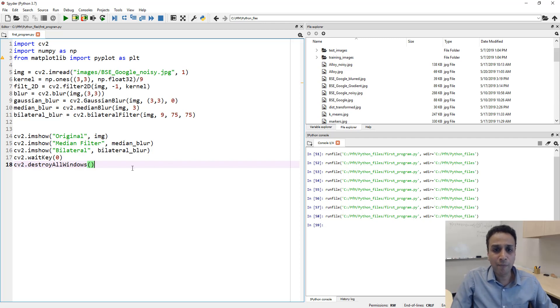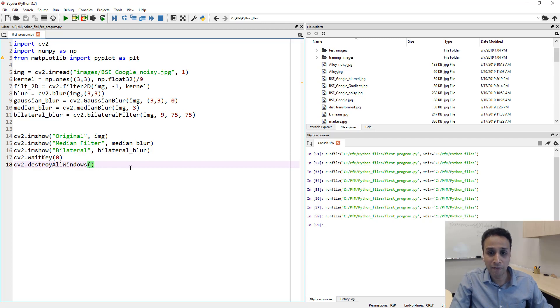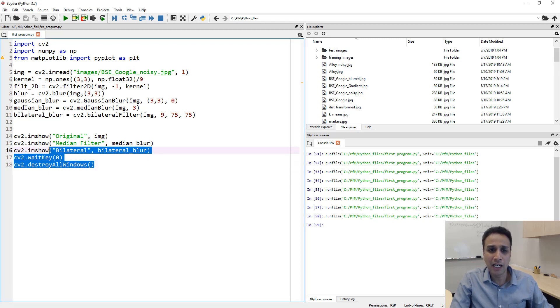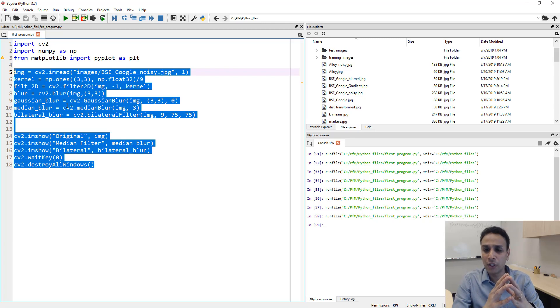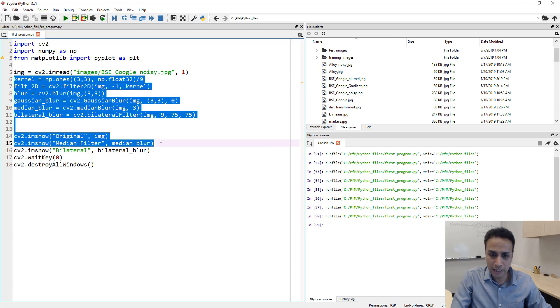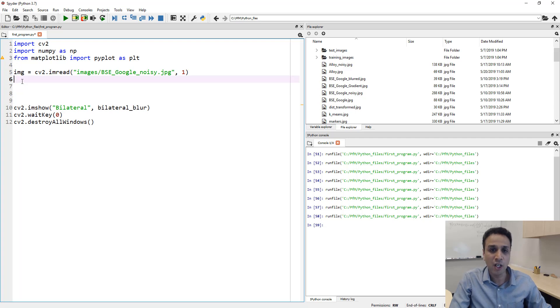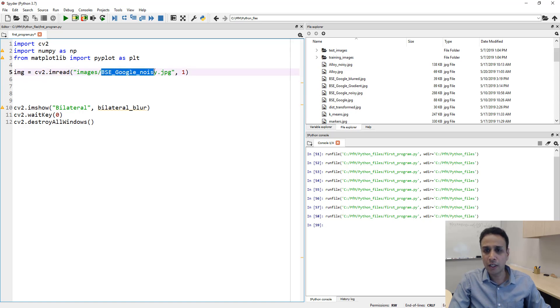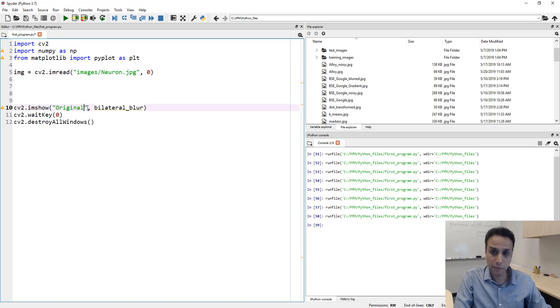Now let's move to edge detection. There are many options in scikit-image which I've already covered, so here I'll show one I probably haven't covered there: Canny edge detection. Let's read a new image — a neuron image — using 'cv2.imread('neuron', 0)' to read it as grayscale. Let's first display the original so you know what we're working with.